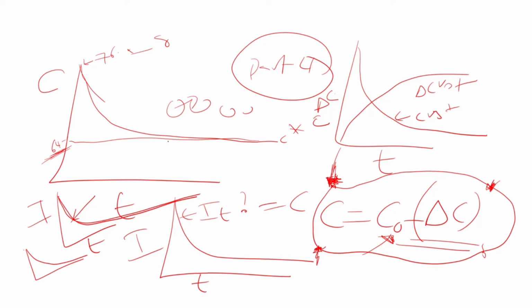Your supersaturation is continuously getting consumed because your crystals are continuously growing, and both will stop once your solution reaches the equilibrium concentration.